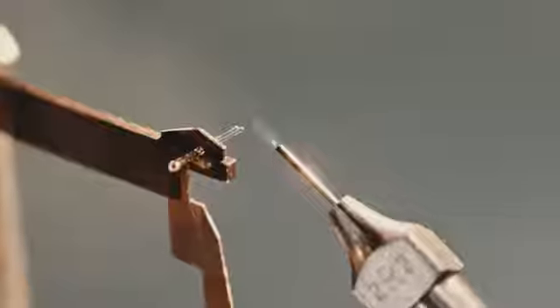Look at that thing. The heart of the sensor. So tiny, yet so powerful.